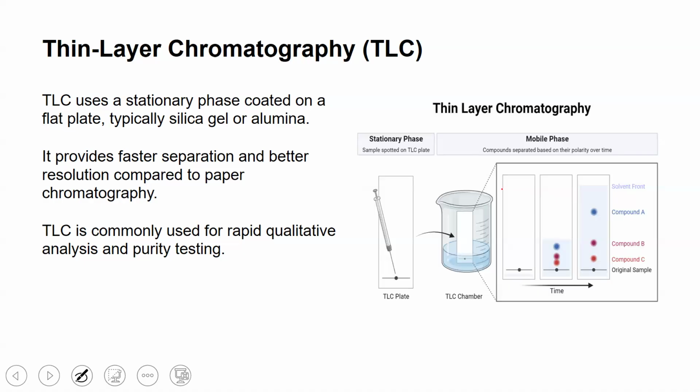And one of the very important things is that thin layer chromatography provides a faster separation and better resolution compared to paper chromatography. And it is commonly used for rapid qualitative analysis and purity testing.